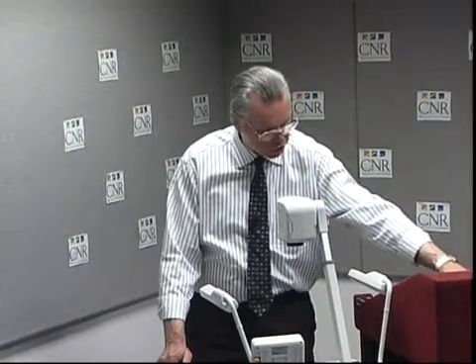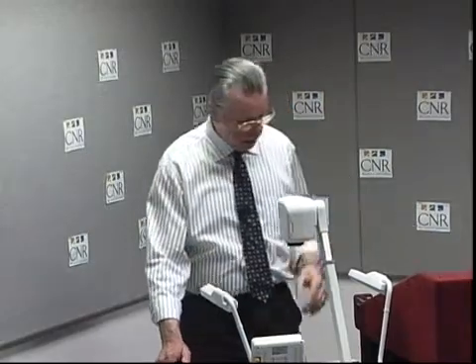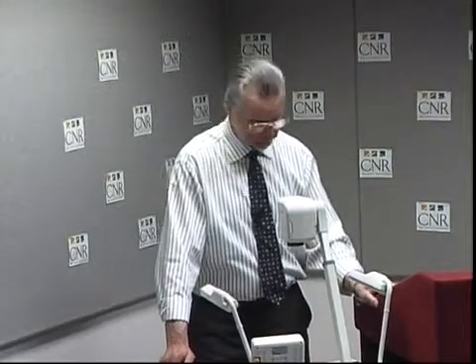Basically, 563, when it was originated, was designed for the cameras that were the only devices that had high enough resolution that were commercially available to acquire a high-resolution image, but unfortunately are limited, and still are, to an area about 30 millimeters by 30 millimeters. This means that when they scan or try to quantify, they are only measuring in this very small area.